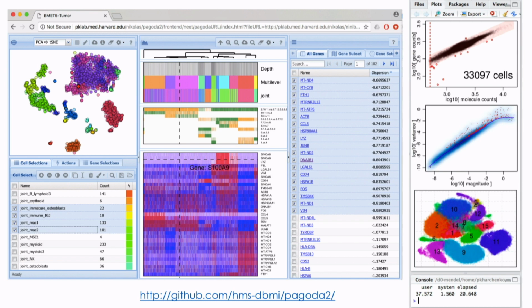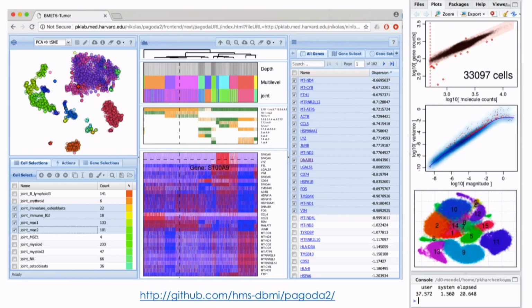And so we actually spend a lot of time writing these types of user interfaces that will present intuitive, interactive views of the data to biologists, because we need to engage them. This is an example with gene heat maps and these types of embeddings. So you can run differential expression here and things like this. They're costly in terms of time to code, but I think for interpreting data, it's still necessary. Hopefully, in the near future, we'll start to automate this a little bit.